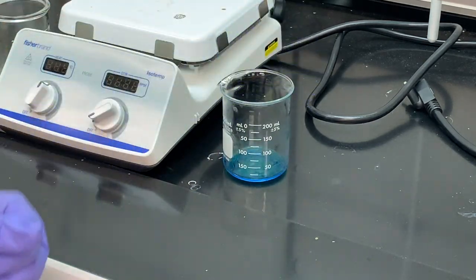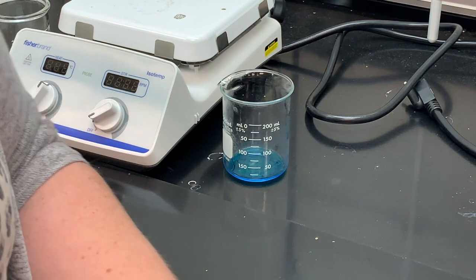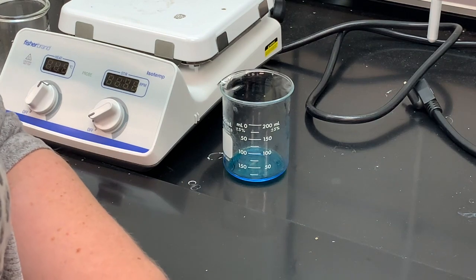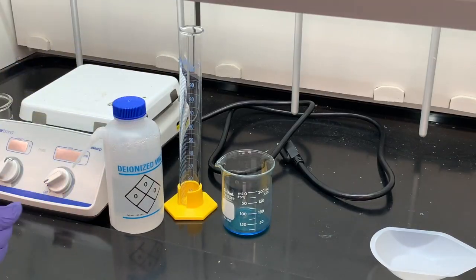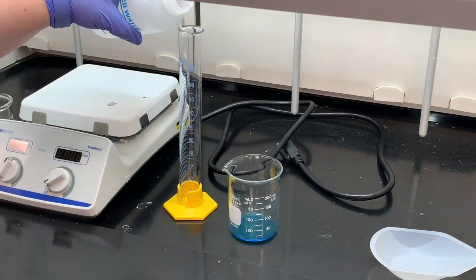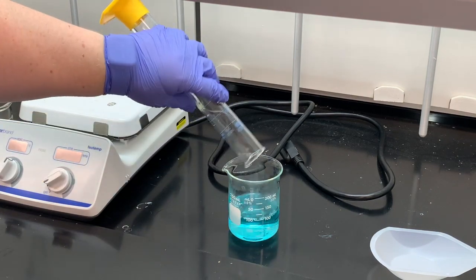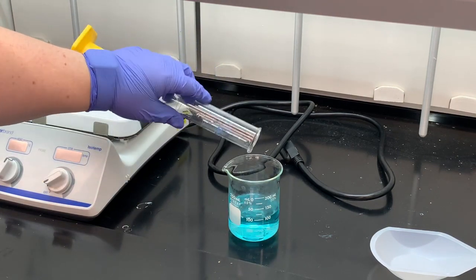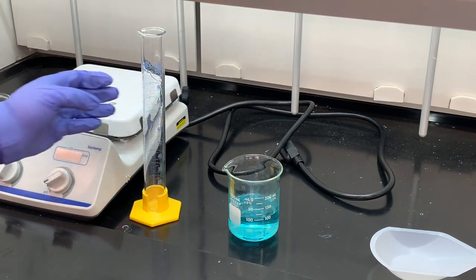So we're going to add 100 milliliters of distilled water. I'm going to measure that out with a graduated cylinder and a bottle of distilled water. So I have a bottle of distilled water and I also have a graduated cylinder. I'm going to go ahead and measure out my distilled water into it. Then we'll add it to the reaction. Remember, there is no reaction here. We're just diluting the solution. You are supposed to make observations for the reaction between copper and nitric acid.